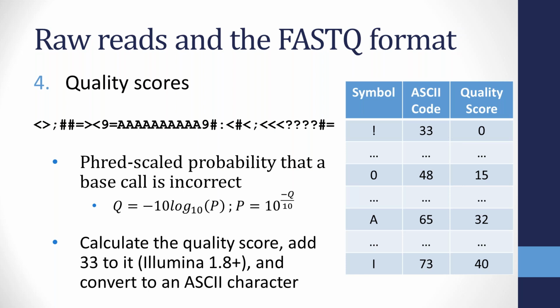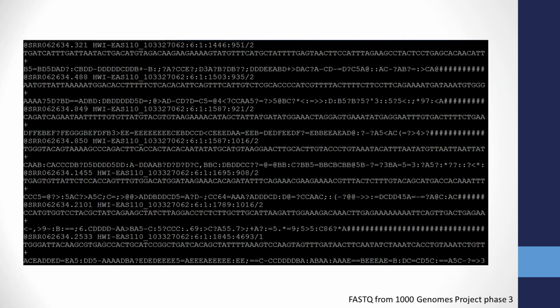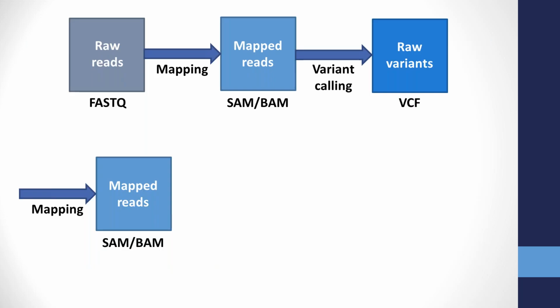So that's a really efficient reduced representation way of including a measure of our confidence in concert with the genetic data itself. Just to show you what it looks like on a computer, most of this is done in Unix-like environments because these file sizes are very large, but this is what you might see. So you see the reads basically repeat every 4 lines, and everything's just kind of all the way down. This is a non-compressed format so that we can visualize it here, but often you'll see each one of these file types in their compressed representation just to keep file size down.